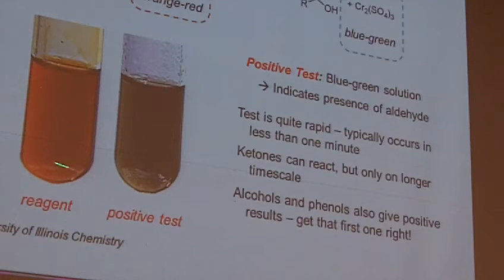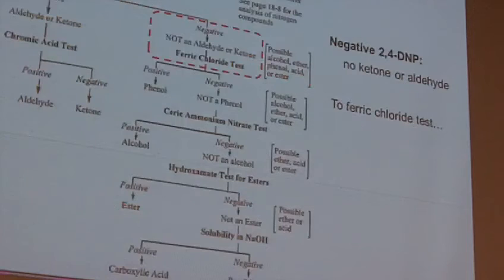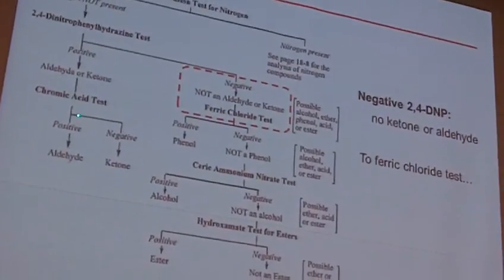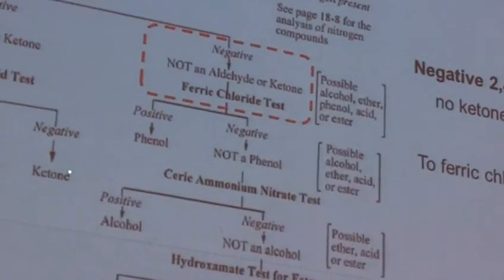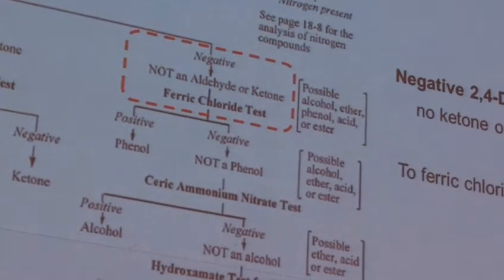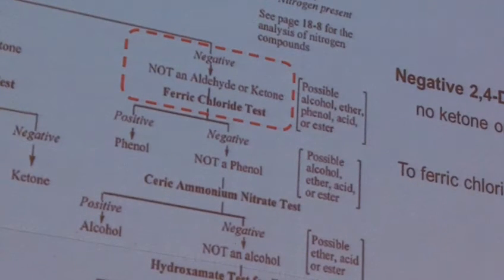We like it when we get color changes like that, and we don't have to squint and decide if it's actually changing or not. That one's pretty obvious. All right, so back to the overall flow chart. If that one's positive, you end up with an aldehyde. If that's negative, there's no color change, then you have a ketone. So at that point you're done. You've identified your unknown.